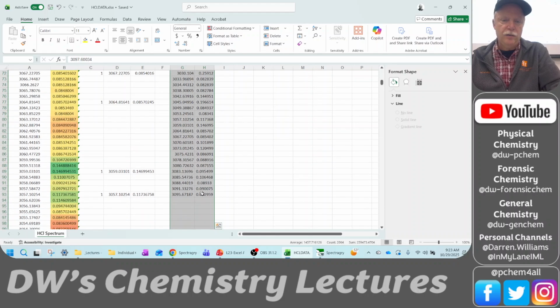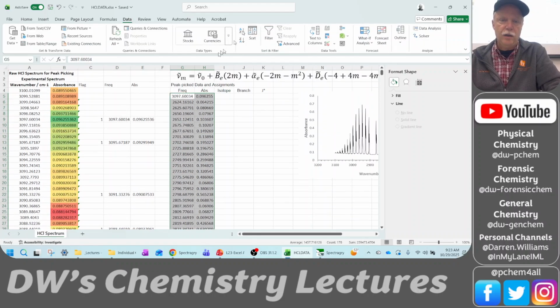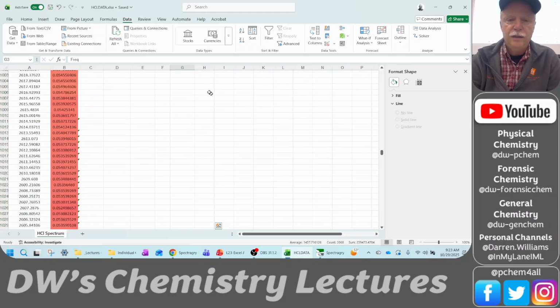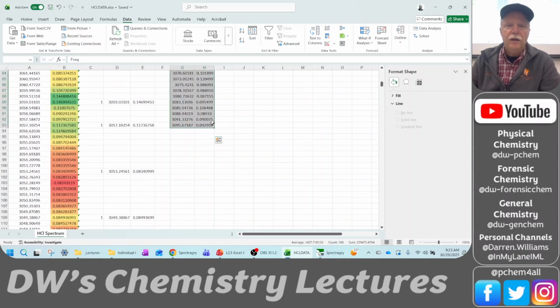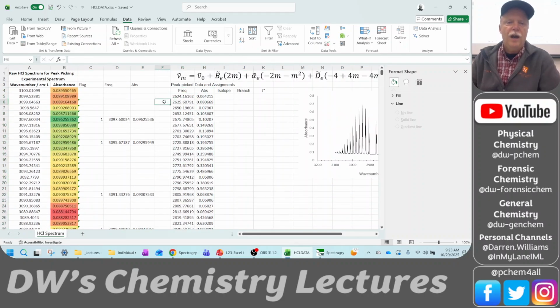Okay, I just want the data. So I'm going to grab that and I'm going to sort. We can do low to high again. Okay. And it keeps picking up that 3097 as a data label. Okay. Sort low to high. Yeah, there we go.